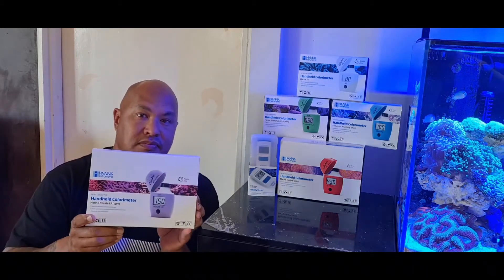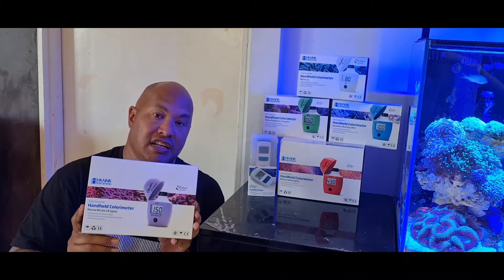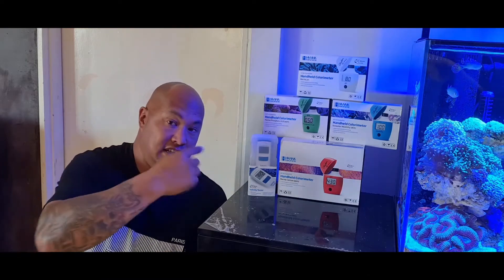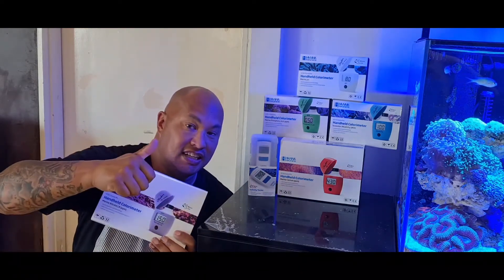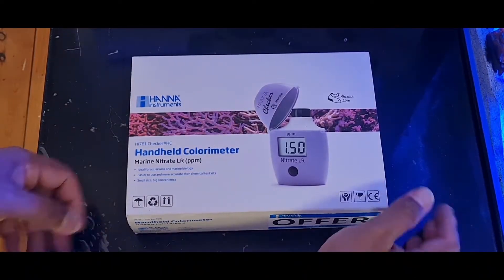G'day, on Stokos Reefing I check out the Hanna HI781 Nitrate Checker. We'll do an unboxing and I'll do a test with it and see what it's like. I'm a big fan of the Hanna checkers, so let's get to it. Let's check out what's inside the box.